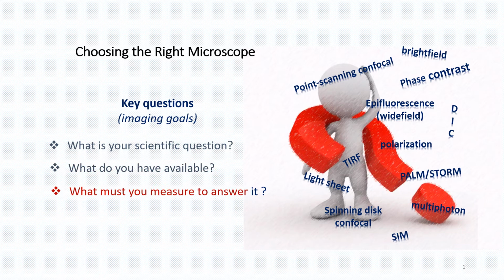Thirdly, you should think in advance how you might potentially analyze your images, because that will also influence how you collect your data. Remember, microscopy does not only involve generating beautiful images. Those images contain a lot of quantitative information that can be extremely important to achieving your imaging goals.